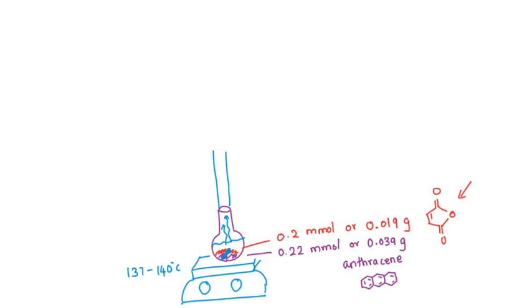So we need to bring the solvent back into the flask. That's why we have the condenser. It condenses the solvent back into the flask. Like while you're cooking, you put a lid on your pot. It just keeps the steam inside your pot, and it doesn't allow your food to char, right? Keeping moisture inside your pot.